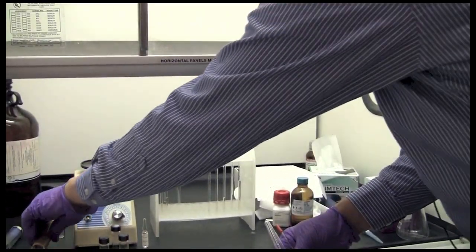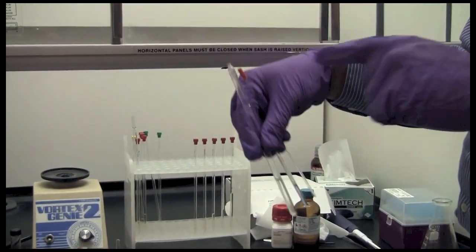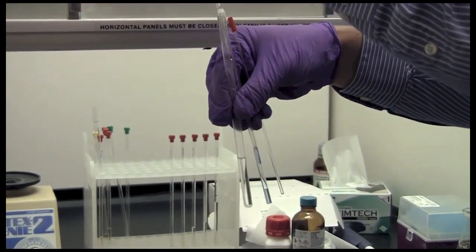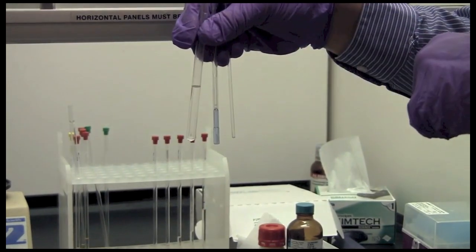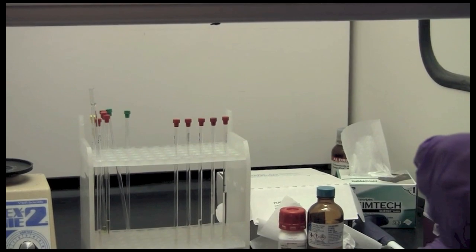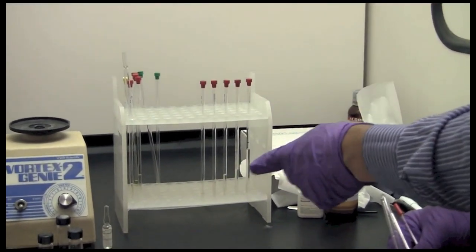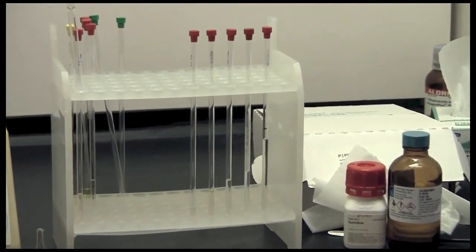In a later video we are going to cover some more advanced methods for preparing samples for NMR including sealed tubes, Shigemi tubes, and tubes with different diameters. We will also talk about the theoretical reasons why proper NMR sample preparation matters and we will show you some real world results of improperly prepared samples and the results on the data.